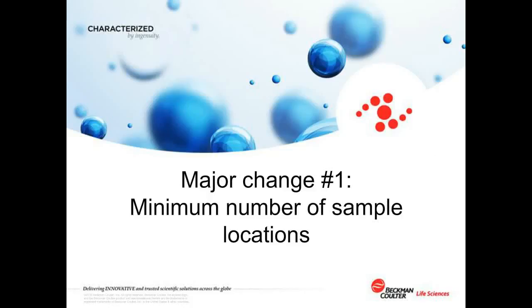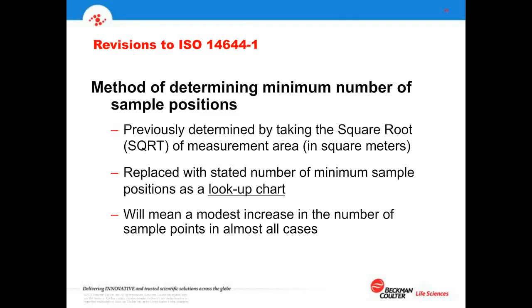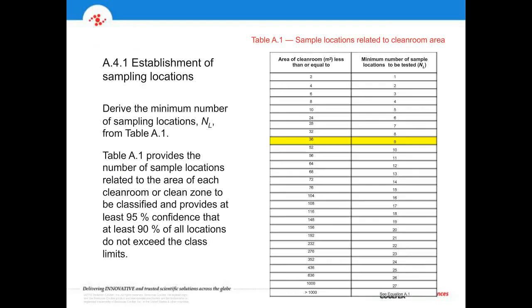So again, back to it, as we mentioned before, minimum number of sample locations has increased, and it uses this chart.